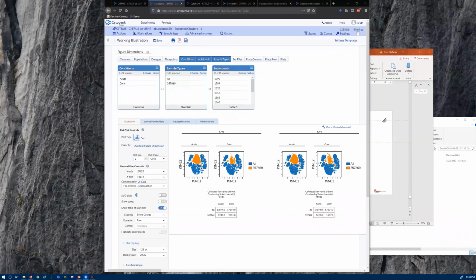For example, if you really have an unequal group size, you probably should use some non-parametric methods to do the statistical testing rather than parametric methods, because parametric methods often assume the background distribution is a normal distribution, and you need to have an equal, balanced group size in your experiment. So in those cases, the solution is to pick the right statistical test.